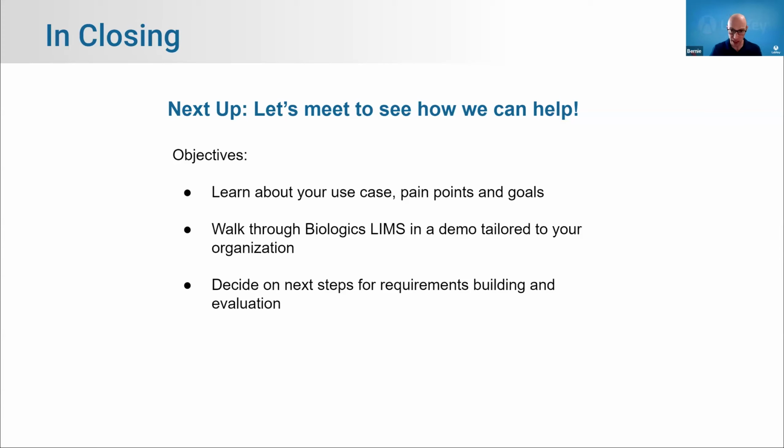But once it's past that state, you'll still be able to say, this one replicate is a massive outlier. We have no idea what happened. Or maybe you can go back in the plate and look and see that you had massive evaporation and your measure was way out of bounds. You have the ability to mark that one as excluded, and then those replicate calculations will be rerun. And so you'll still see that there was a result, but it won't mess up your analysis.